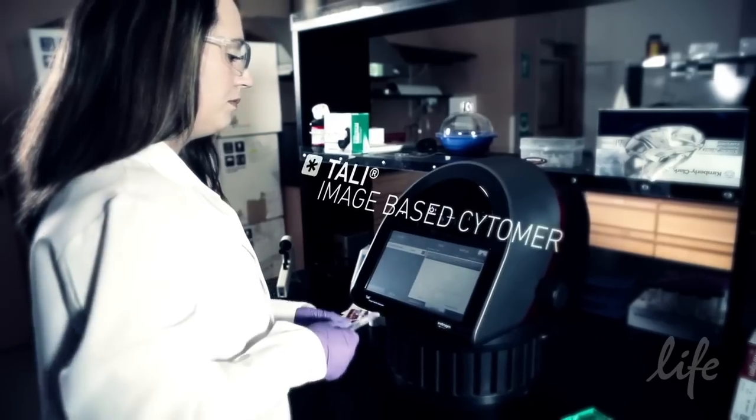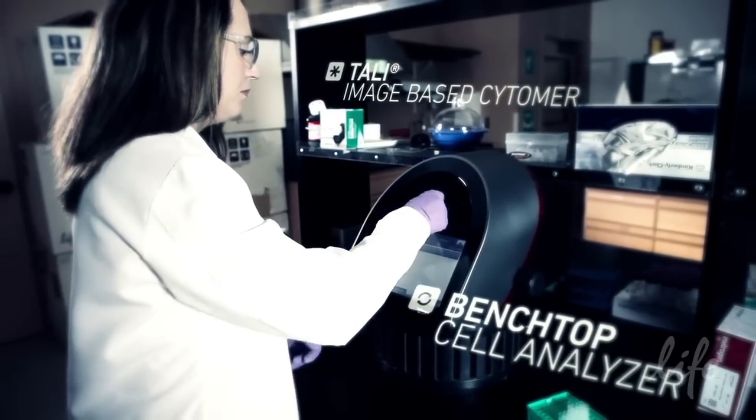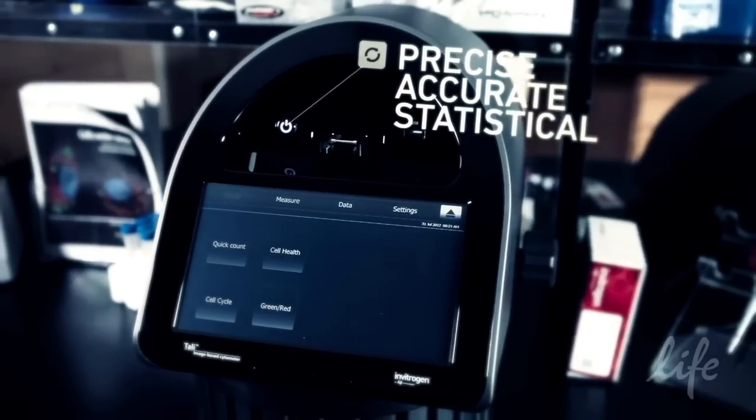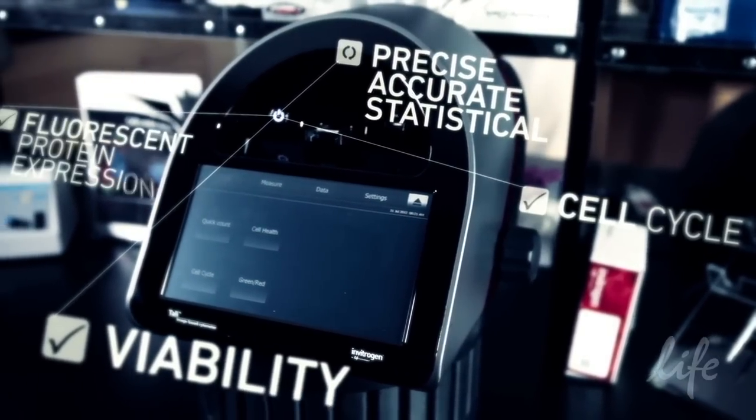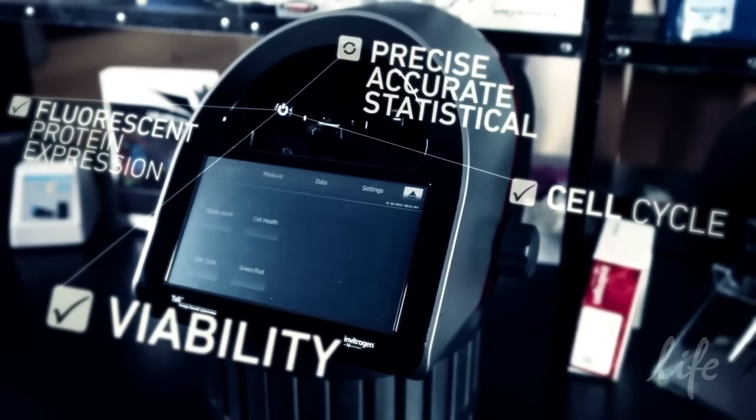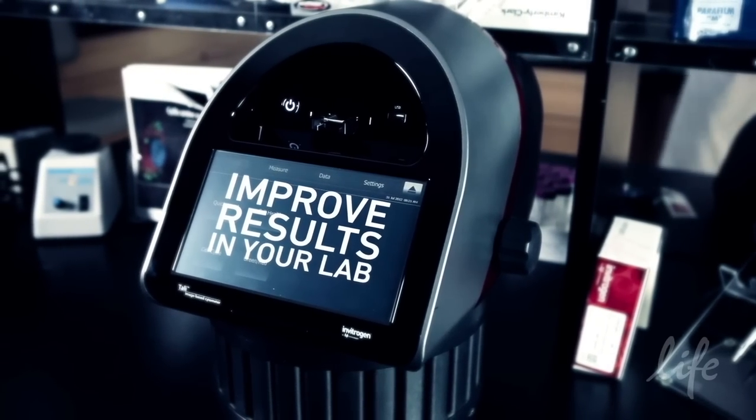The TALI image-based cytometer is the benchtop cell analyzer that gives you precise, accurate statistical information on cell health, cell cycle and fluorescent protein expression. Discover how TALI can help improve results in your lab.